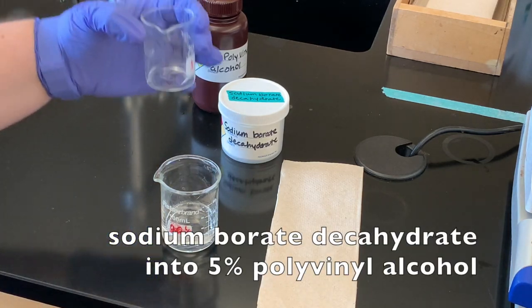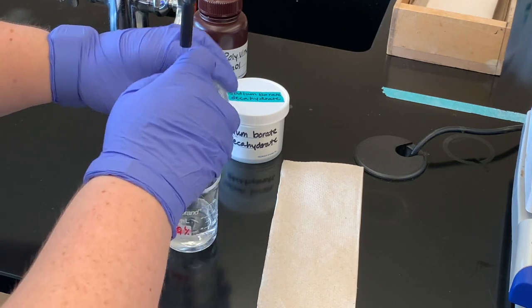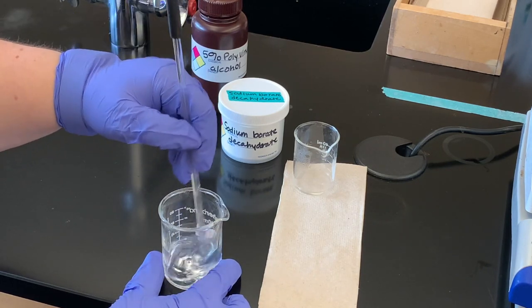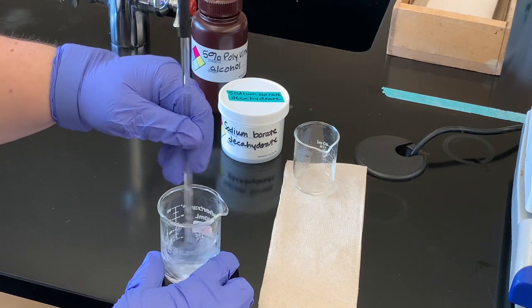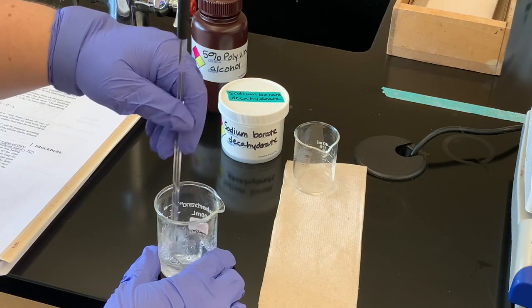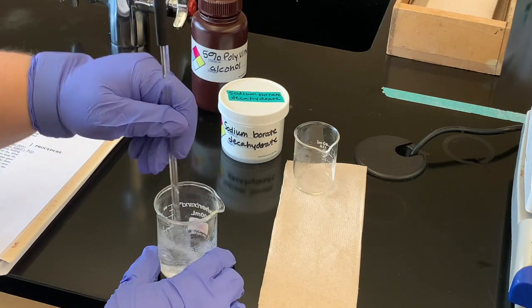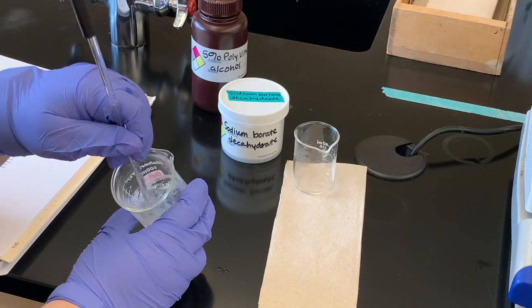I'm going to stir and add the sodium borate decahydrate solution to the polyvinyl alcohol, noting any viscosity changes. Immediately when I started pouring — this is going to be kind of hard to see on video — I can tell it's getting thick in there. If I pull that up you should be able to see it as well. We're going to stir for a couple of minutes, and it's definitely become a lot more gelatinous. The viscosity has gone up.